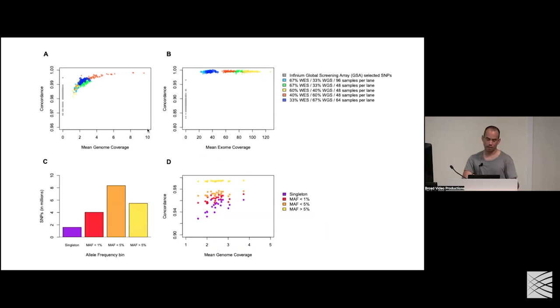This is kind of the final figure of this. I would say this is probably the most important figure. These were different iterations that we did as we started with different blending operations. What you would see early on as we ran through is we went way too high on the exomes. We did pretty well. The goal was to just not drop our exome coverage too much. But with the low pass genomes, we wanted to hit a sweet spot: how much coverage do we need to get strong concordance with our 30x whole genomes.